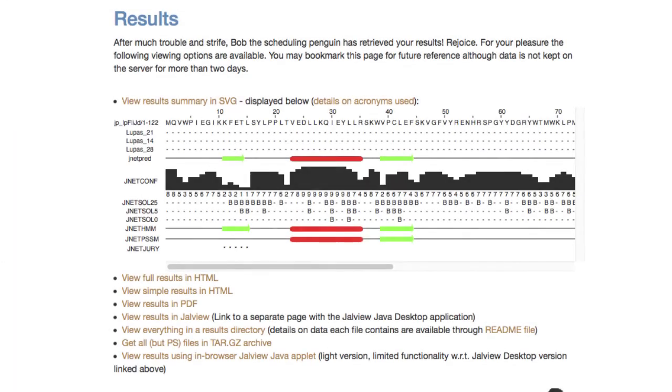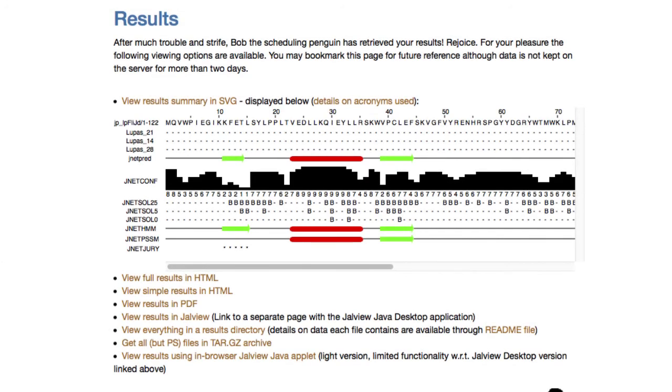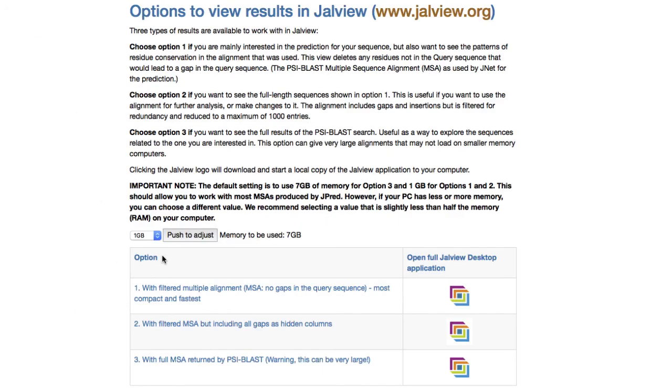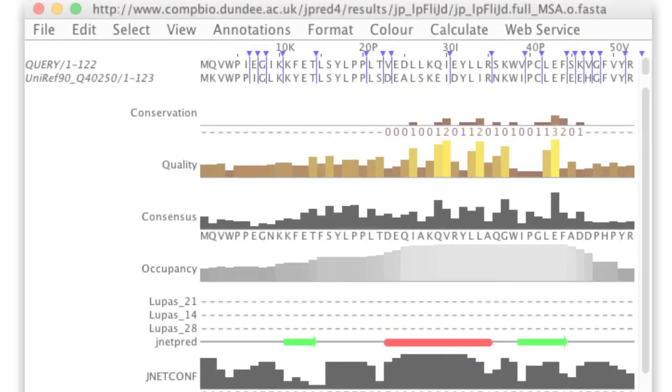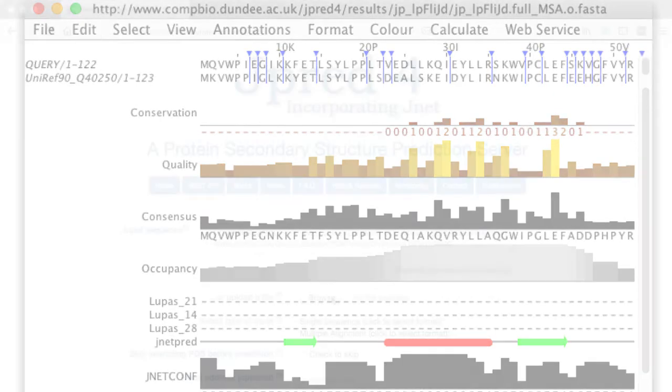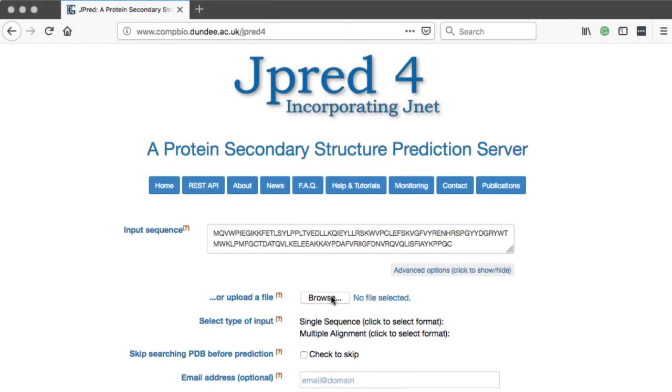The results can be opened in Jalview by clicking on the View Results in Jalview button. This opens a new page. There are three viewing options. Selecting the filtered multiple sequence alignment, Jalview displays the alignment including gaps as hidden columns. For more information about JPRED, please visit the JPRED website.